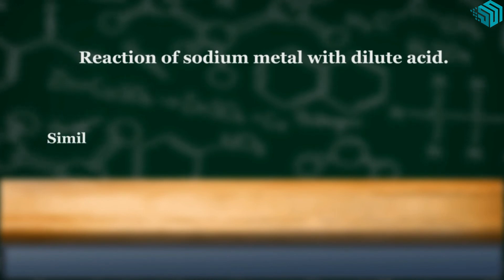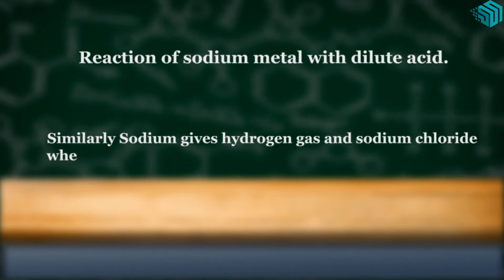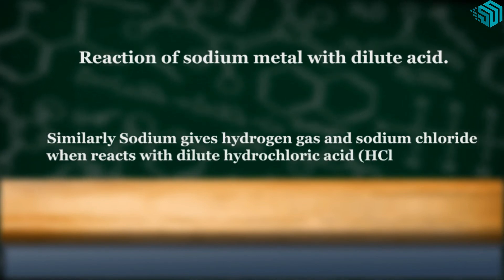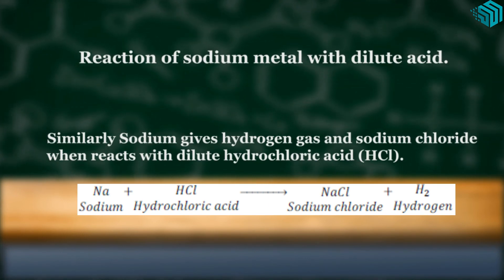Reaction of sodium metal with dilute acid. Similarly, sodium gives hydrogen gas and sodium chloride when it reacts with dilute hydrochloric acid. Sodium plus hydrochloric acid gives us sodium chloride plus hydrogen.